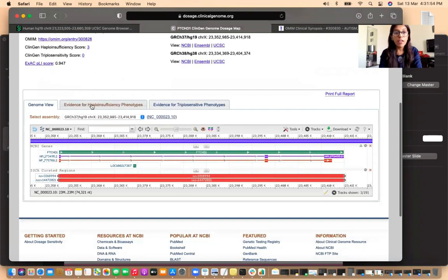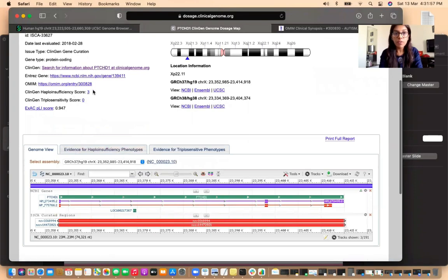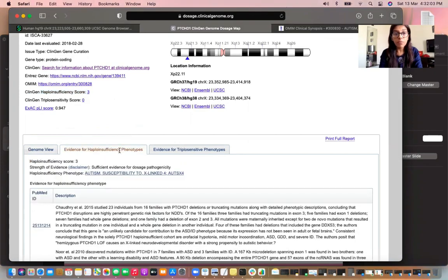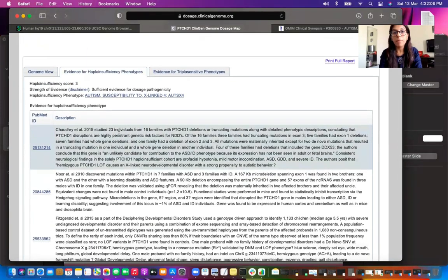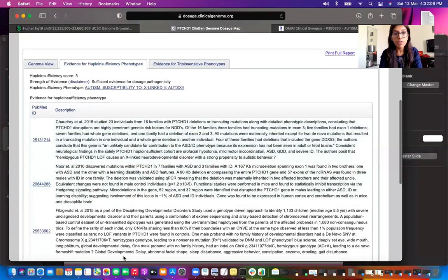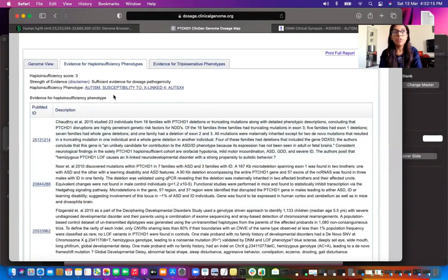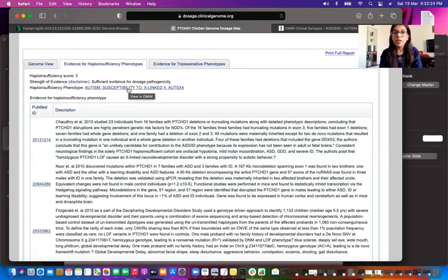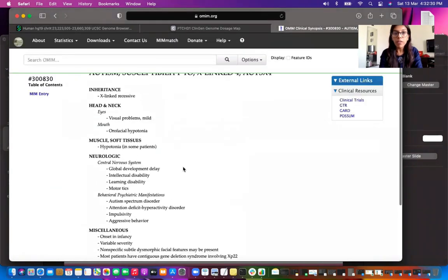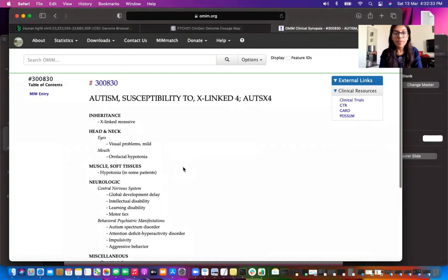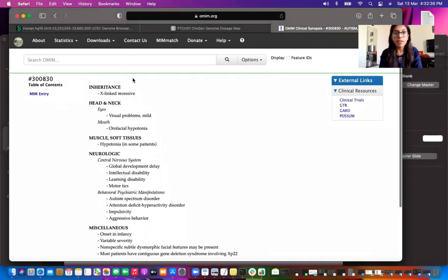Looking at the deletion, we check the ClinGen haploinsufficiency score and find it is 3. In the evidence for haploinsufficiency phenotypes tab, there are a number of studies. An important step is to understand which disease the CNV is linked to. The ClinGen dosage sensitivity map page also redirects us to the OMIM page, where the clinical synopsis shows this is an X-linked recessive gene.